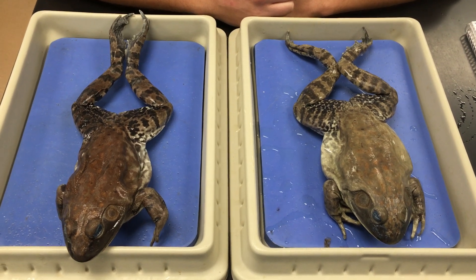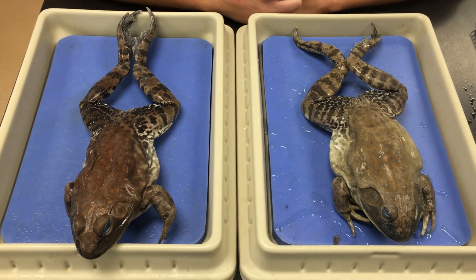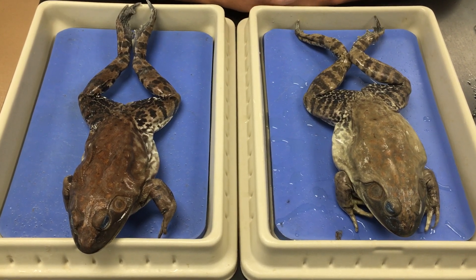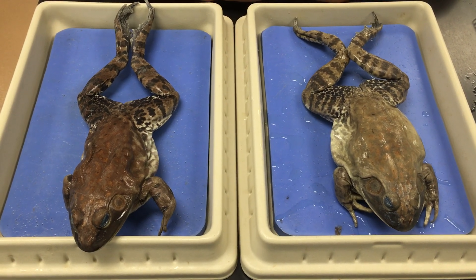Hello, 154 Biolab. Today we are going to be doing the first of our vertebrate dissections. We are going to be looking at the anatomy of a frog, to represent the phylum Chordata and specifically the subphylum Vertebrata.